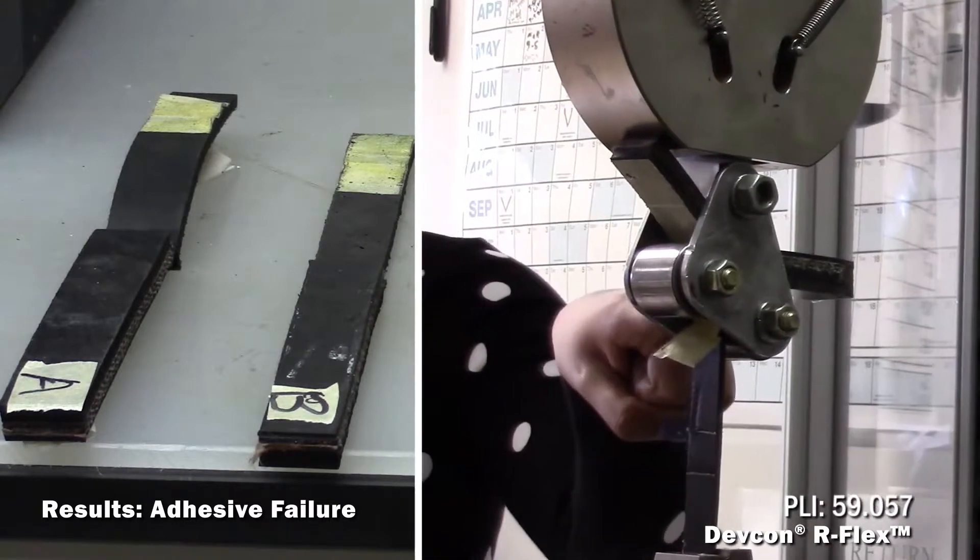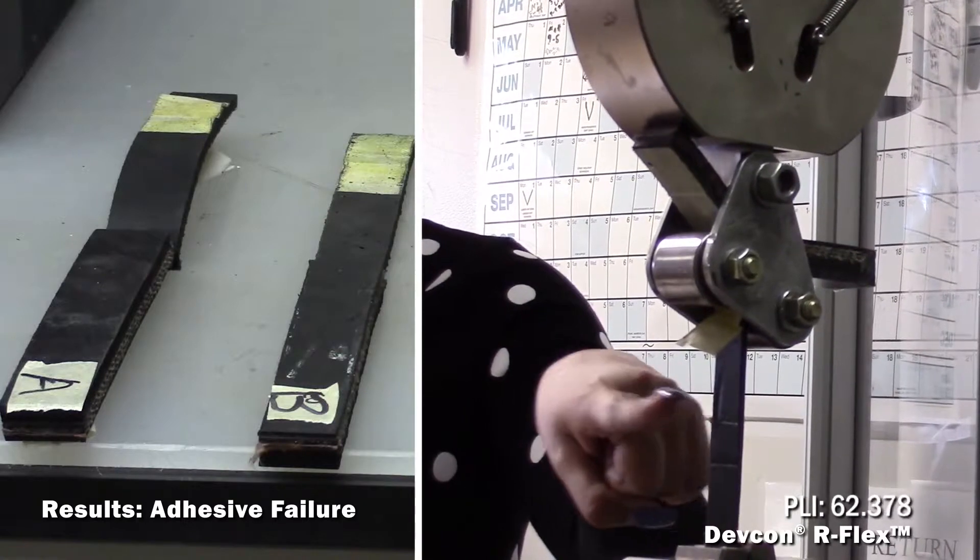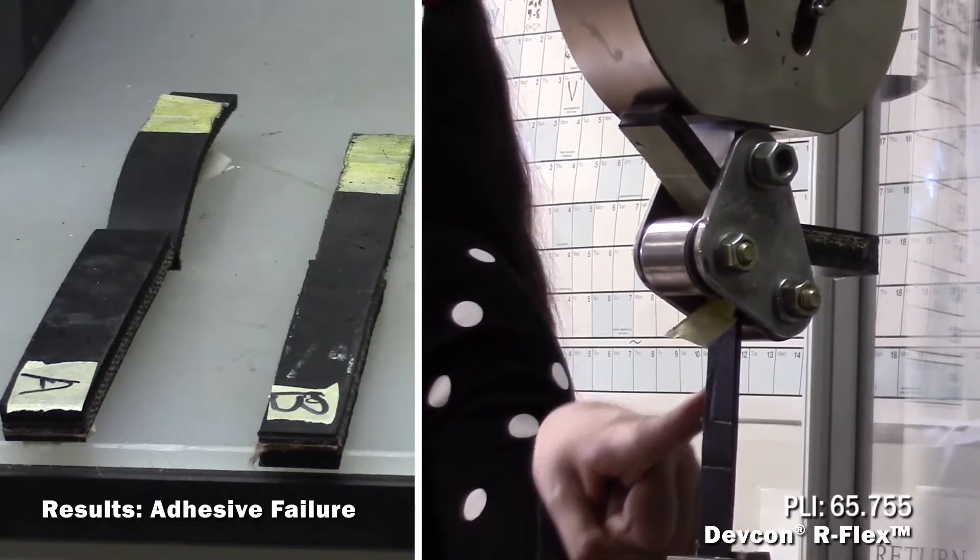The adhesive is pulling the rubber from itself. Instead of adhesive failure, we see surface pull of rubber.